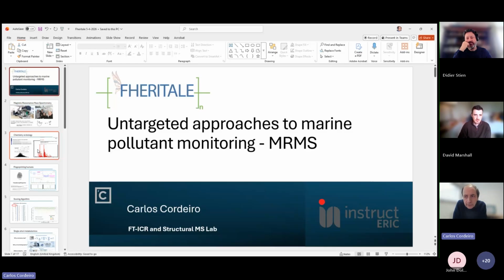Yeah. I think in the future, the difficulty to couple this with LC-MS is that with LC-MS you don't have the time scale when you do direct infusion. You're seeing everything at the same time, so it's difficult to correlate one with the other. You ask me, why, Carlos, don't you use an HPLC? Oh, I have quite a few sitting in the lab that I only use on special occasions.